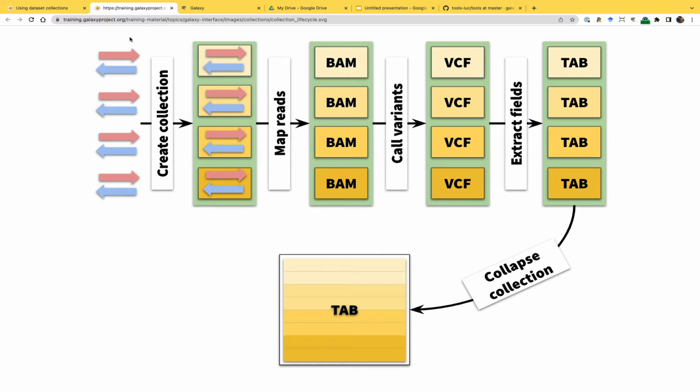All right, so this is kind of a story. Today we're going to talk about data handling. We're not going to talk about any particular analysis per se, because all analyses are the same. You have data, you run tools on it. Well, of course, there are different kinds of analysis and different kinds of data, but conceptually, a tool gets input and produces analysis.